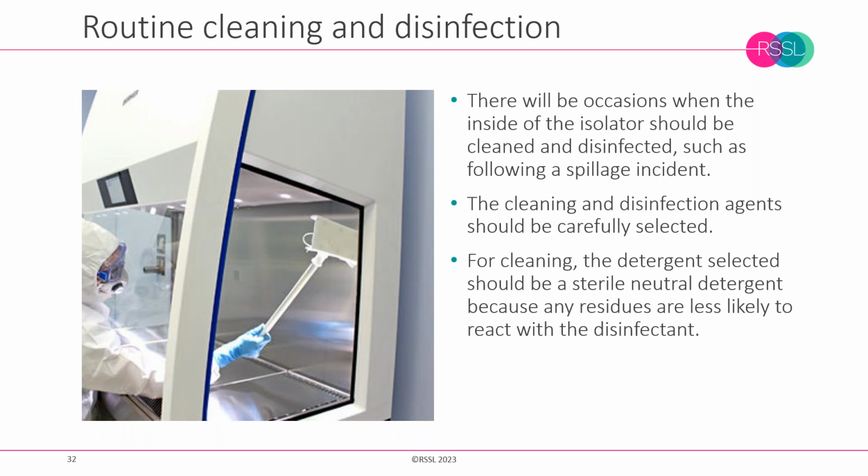I mentioned earlier about cleaning isolators, so it's important that we're regularly cleaning, and especially prior to decontamination, and we're using detergents and disinfectants that are not going to be overly aggressive to the isolator material, and which are not going to cause scratching or rouging. And certainly if we get scratches, then we're creating reservoirs in which spores can be deposited, and we may get microbial survival.